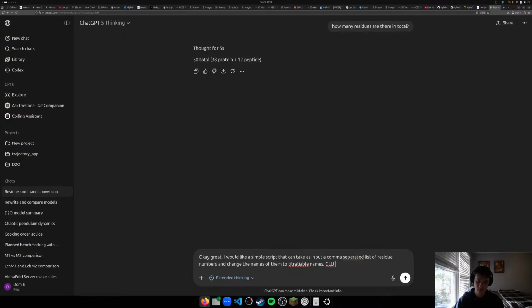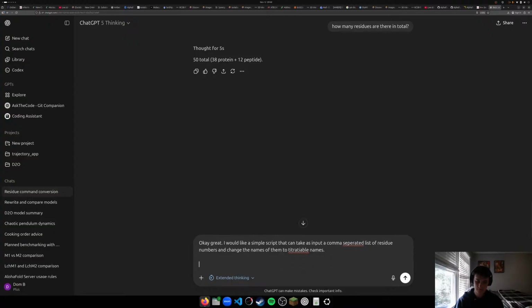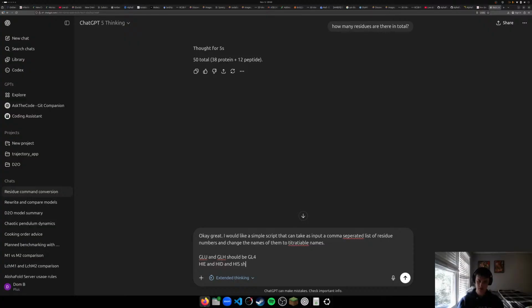GLU and GLH, GLU, GLH should be GL4. HIE and HID and HIS should be HIP.